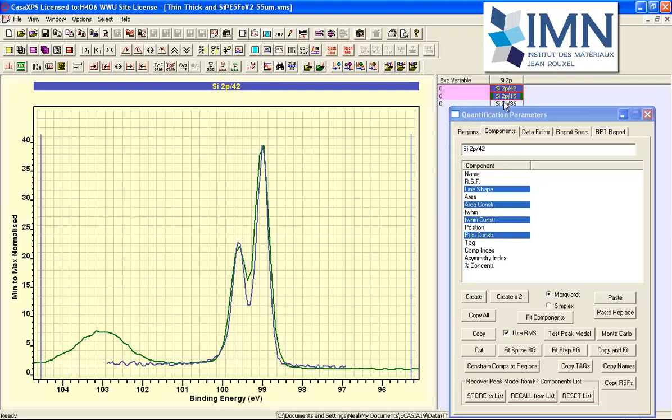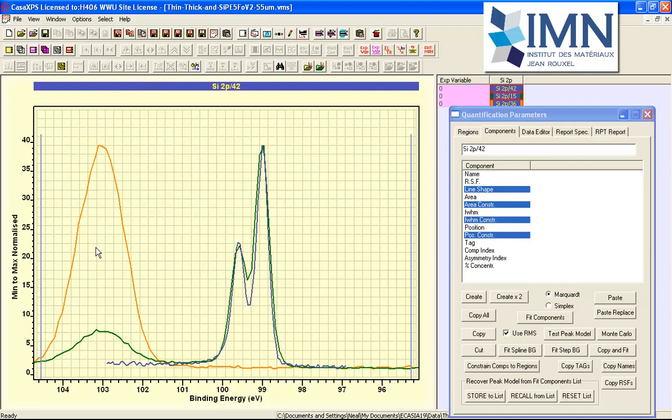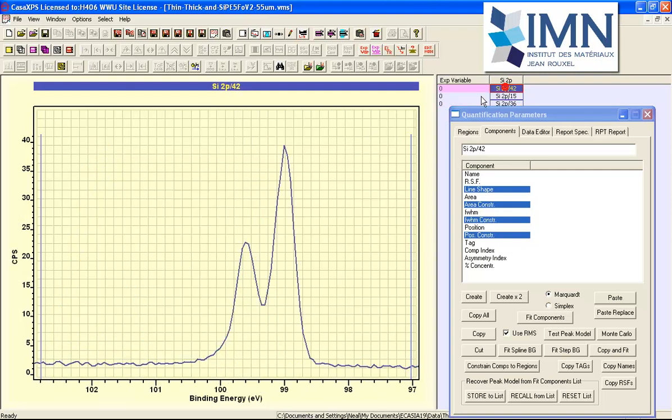So finally, let's do a comparison against another spectrum, and this one is thick oxide on a silicon wafer, so thick that we see almost no evidence of the elemental silicon, and we simply see an oxide peak, and its position and its shape are very similar to this thin film. So it looks like the blue spectrum is indeed from elemental silicon, and there's no oxide that would be associated with a film of silicon oxide on this wafer.